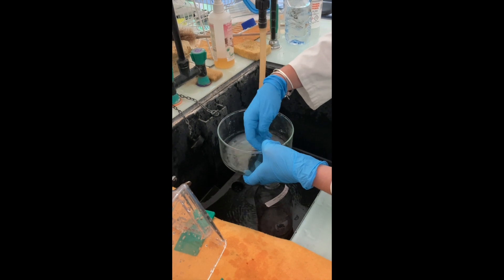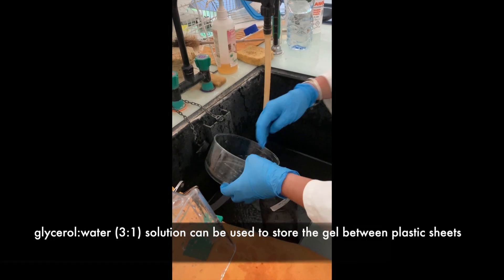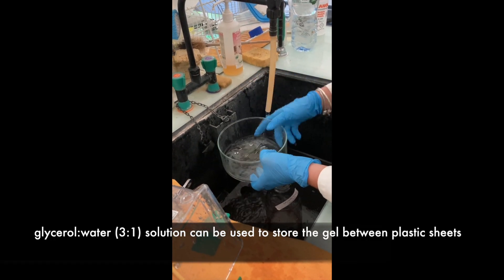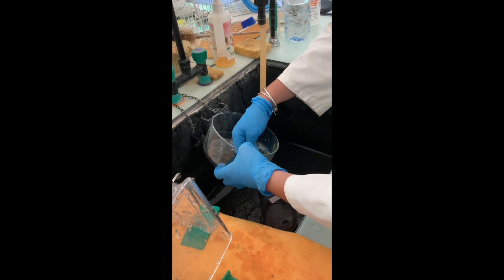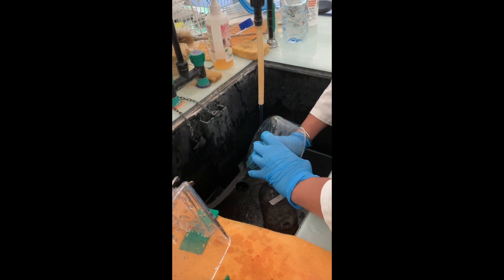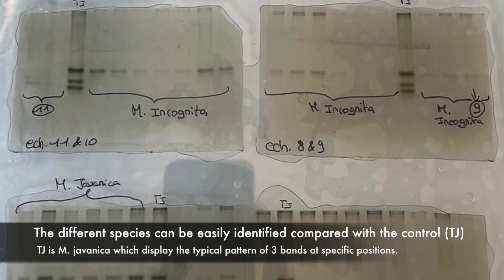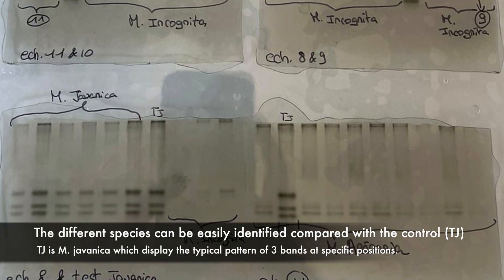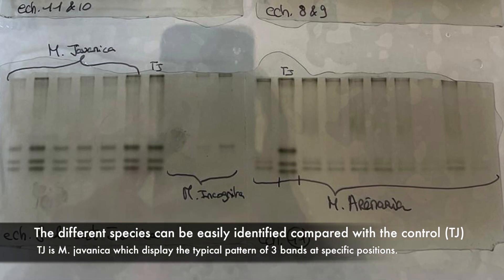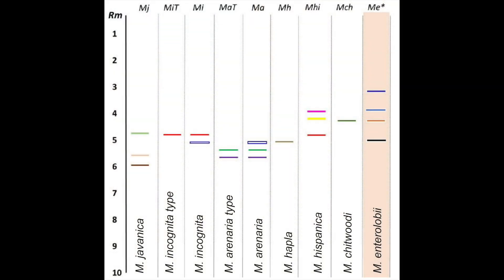A glycerol-water solution at a ratio of 3-to-1 can be used to store the gels between two plastic sheets. The different species can be identified by comparison with the control Javanica, shown as TJ on the picture. TJ is Meloidogyne javanica, which shows a typical 3-band profile at specific positions. Here is a representation of the expected profiles for the different species of Meloidogyne.